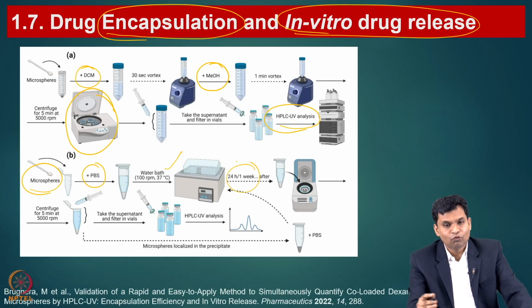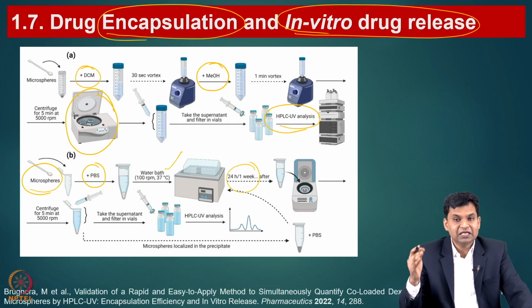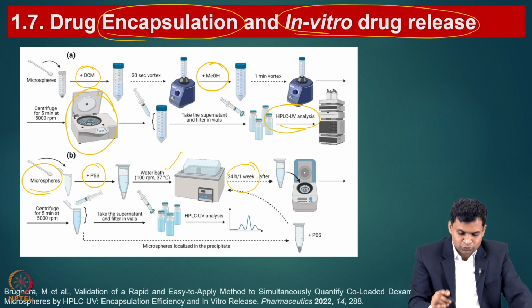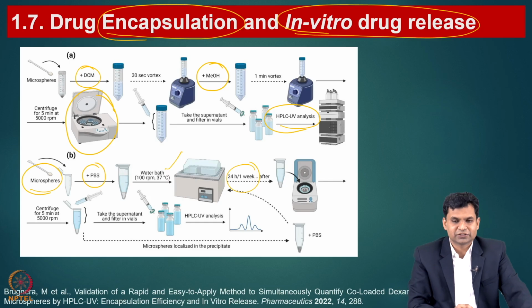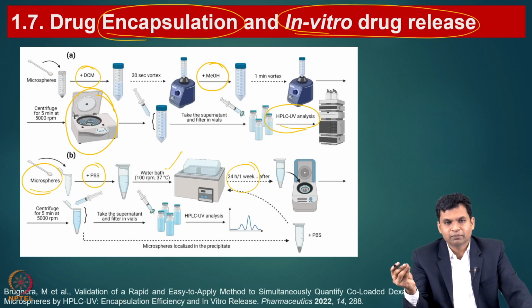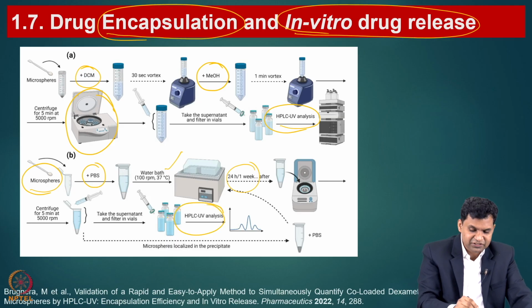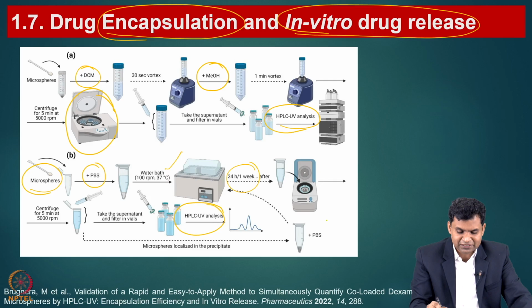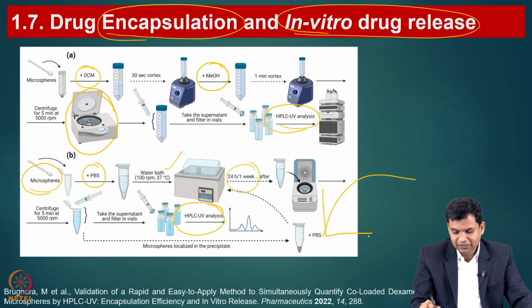This may go from 1 hour to 24 hours, sometimes 2 days, 3 days, and it may go for 1 week. If it is an implant, it may go for years also. So, we need to see the release of the drug from the formulation into your buffer. Then take that buffer, do the quantification and perform the required studies, and from that you will understand how much drug is releasing at different time intervals.